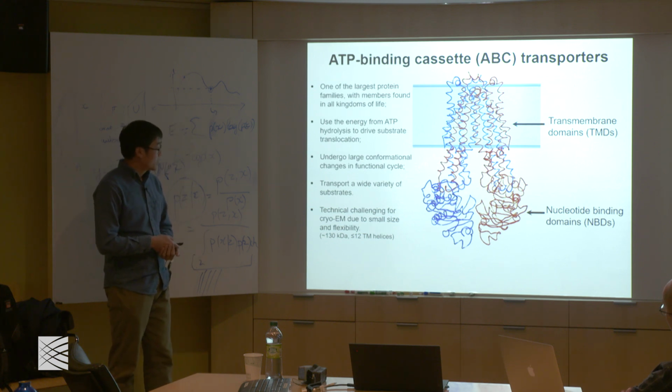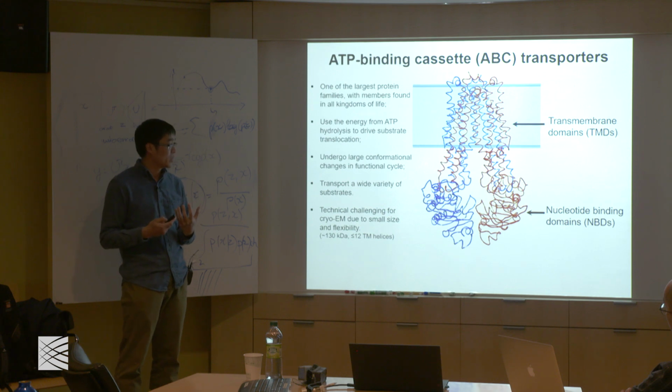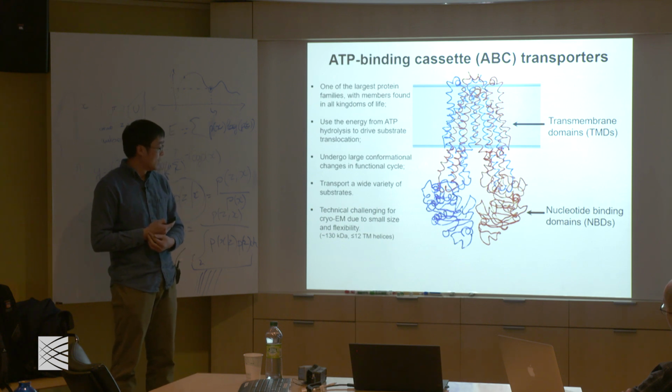Because it's very small and it also undergoes a large conformational change, it's very flexible in a sense. So it has been very difficult to study by structural approaches.